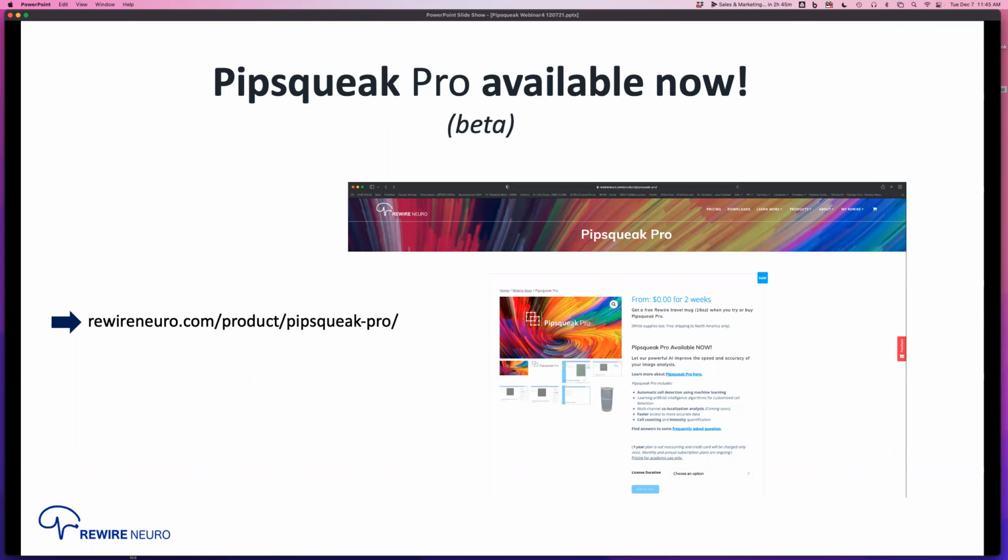Cool. And the other thing I was wondering about, which I just realized I never really knew, is how does Pipsqueak get the information about the pixel size in every image, or do we have to input that manually, especially now in Pipsqueak Pro? If you want to convert your pixels into micron distances or whatever it might be, you're going to have to bring that conversion factor in from your microscope, because it's specific to the objectives that you've got in there.